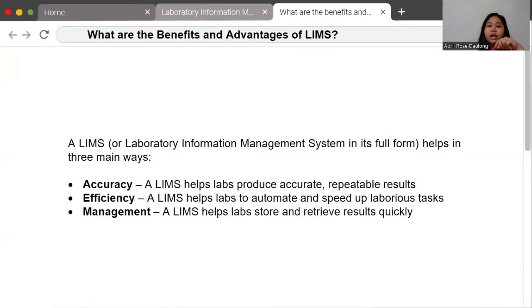So as we have noted, diba, kanang sa mga katong traditional nga buhaton like daghay mga errors, and like dili kayo accurate kay naay times nga magkamali sa mga informations. So unlike sa LIMS nga masakto nimo input ang mga data and informations muna makaproduce yung mga accurate kay dili ko wala ang data kay naara siya sa software tungod sa LIMS.